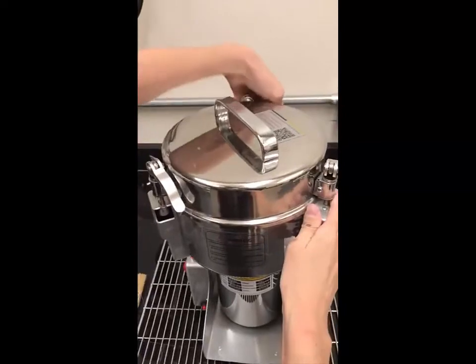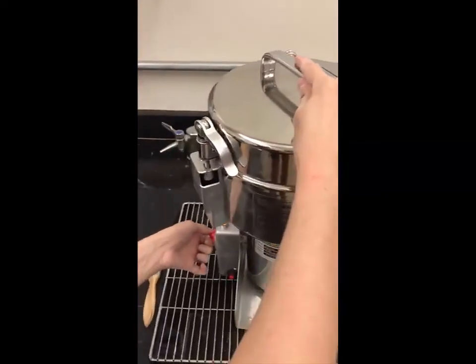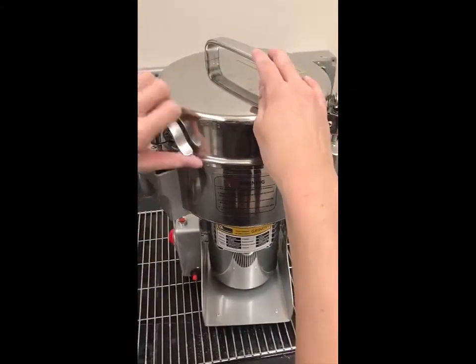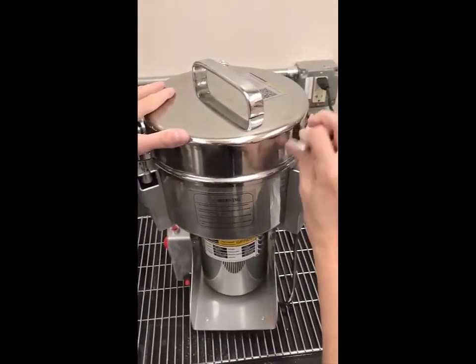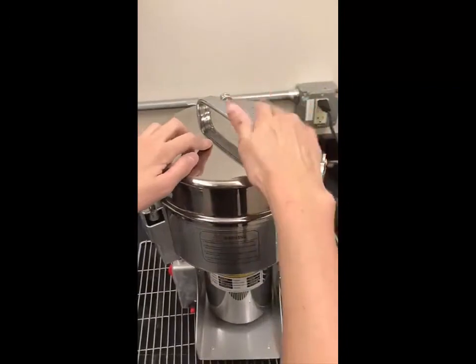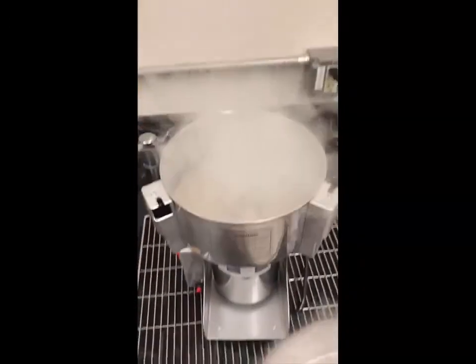Once our sample has been processed sufficiently and is a nice powder, we have to put it in a sample cup and test it with the X-ray fluorescence gun. We're following the protocol that we would use in the field.